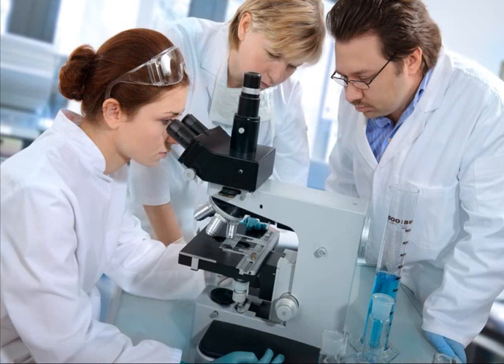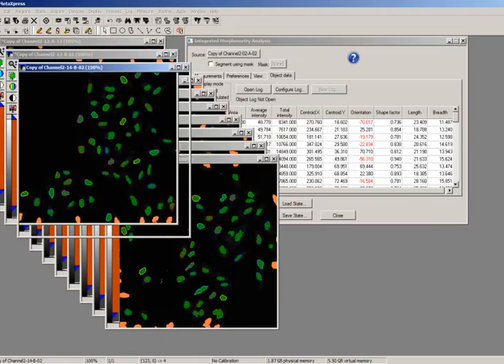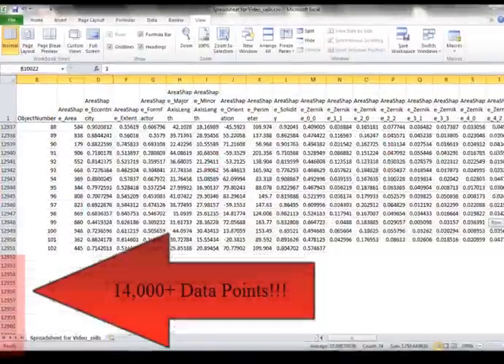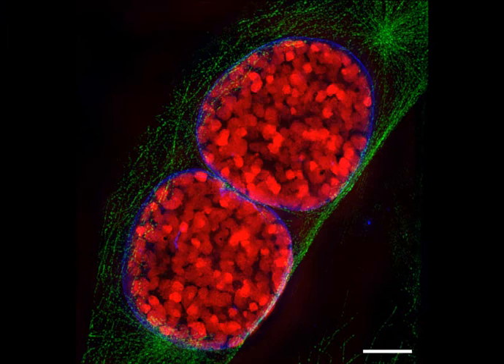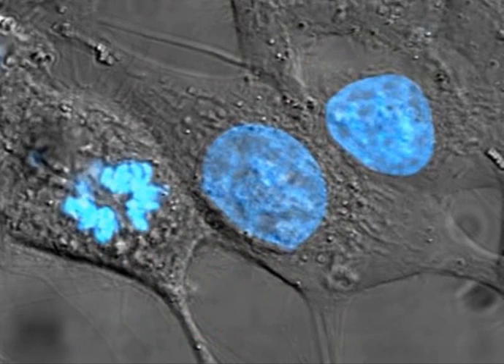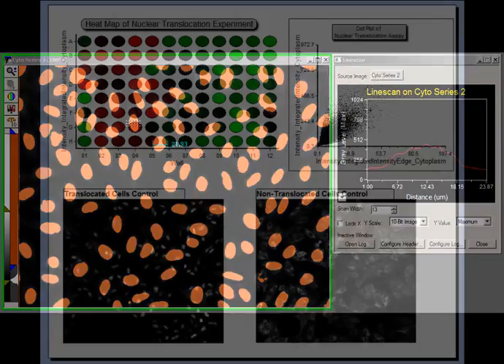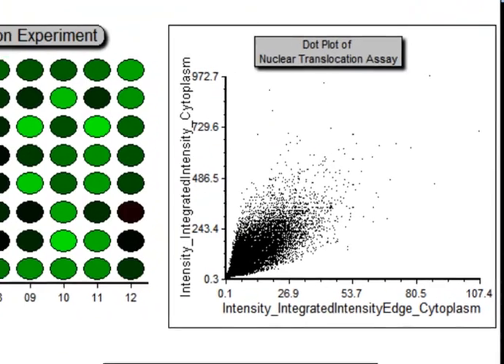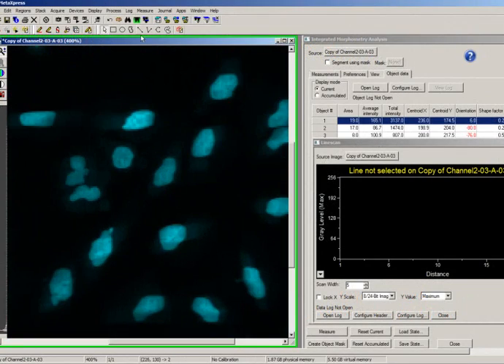If you conduct imaging experiments and measure multiple cellular parameters, then you know how overwhelming the resulting data sets can be. As powerful as microscopy is for generating stunning images, analytical power only comes from segmentation, image analysis, and careful multi-parametric data interpretation. Results come from powerful tools that review the image data and confirm the findings.